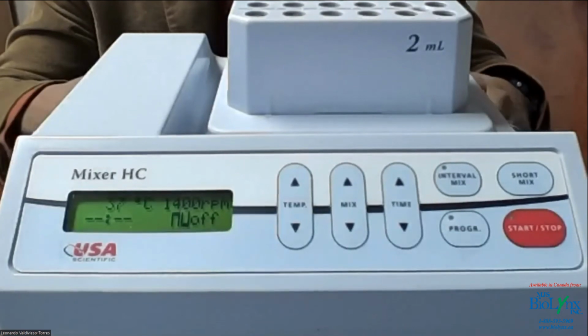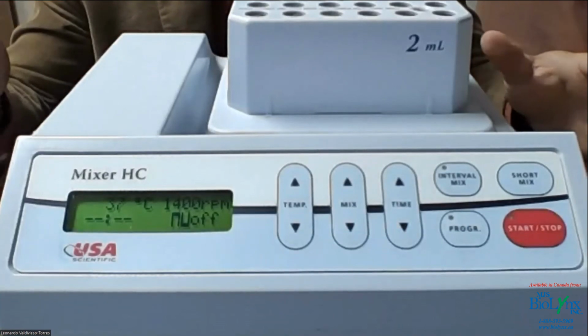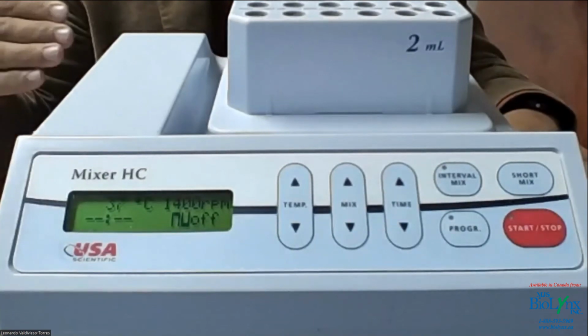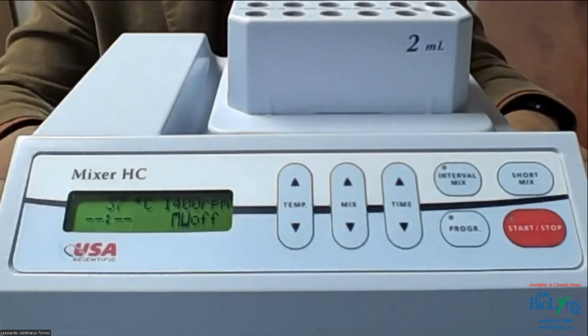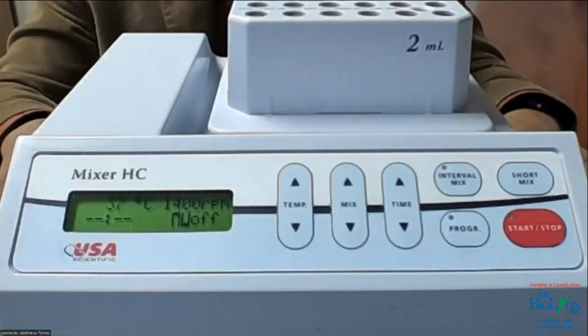It extends the life of the equipment a lot, and that's true for any equipment. So I recommend people turn it on and off when they are in the lab. Don't leave it on all the time, because you're wasting electricity. And unlike a water bath, this will heat up fairly quickly. It has two Peltier elements.